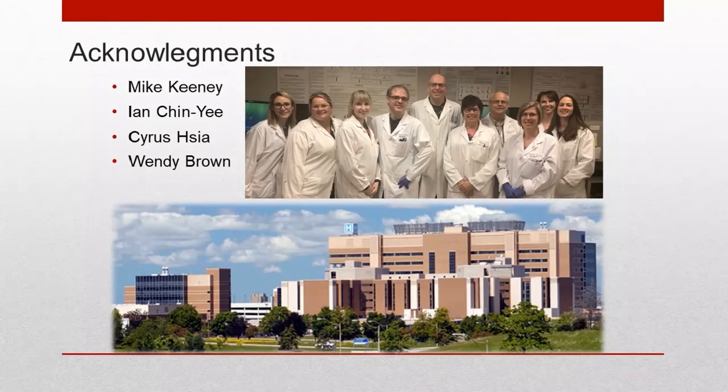So our first question from the audience involves the rationale of the antibodies included in their combination for the 4 10-color tubes. So can you just elaborate on how these markers were included, what kind of tubes were initially evaluated as well, and what the fluorochrome selections involved?